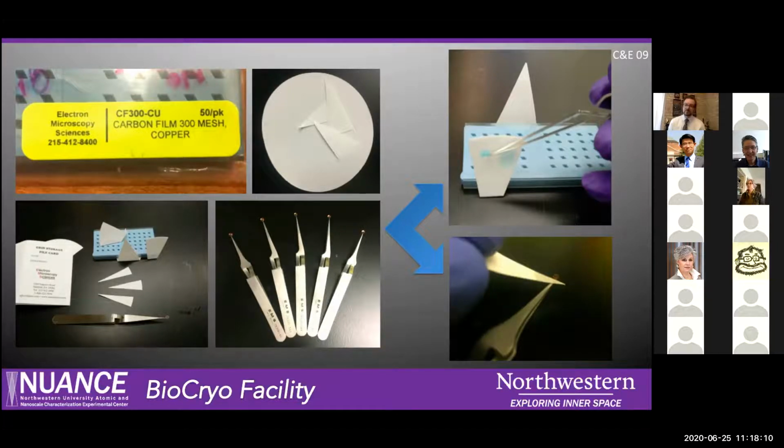This is from somebody who suggested this, or whose technique I watched, George. I like the philosophy about it: you have your solution on your grid, and if you see the filter paper with the blue drop on the upper right there, you come up to that filter wedge, and you can control your wicking a little bit with the angle you come at it.